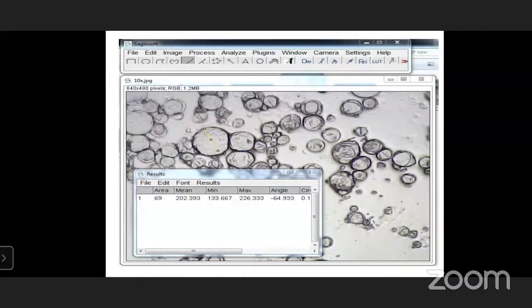See here, this is one of the batches of one of the students, as a microsphere. याच्यामध्ये वेगळ्या प्रकारचे मायक्रोस्पियर दिसतात विथ व्हेरिएबल साइजचे. ओके, सो इफ यू वॉन्ट टू मेजर इंडिव्हिज्युअल सेल और इंडिव्हिज्युअल मायक्रोस्पियरचा एरिया, रेडियस जर काढायचा असेल तर इट इज ऑल्सो पॉसिबल. जस्ट यू हॅव टू ड्रॉ अ लाईन ऑफ one of the cell or that particular particle and then go into the process and analysis and measure that particular area.